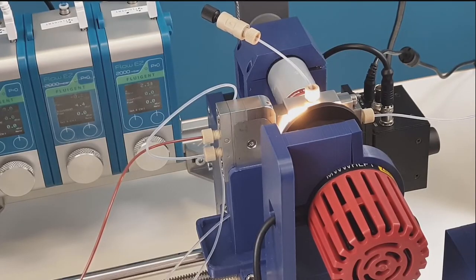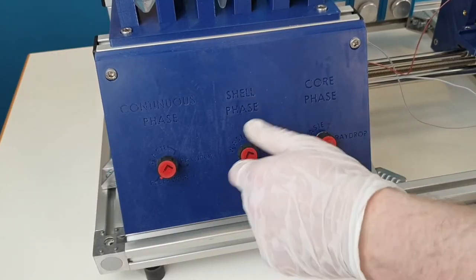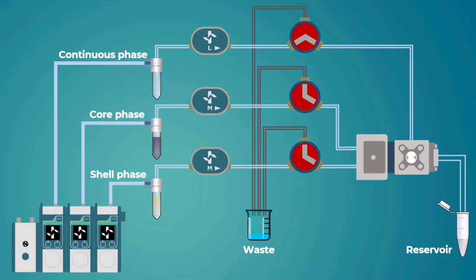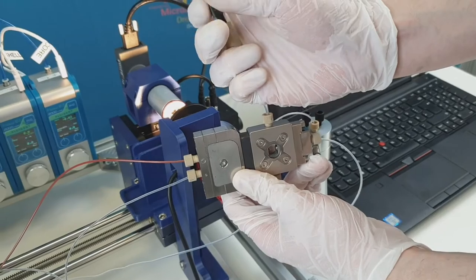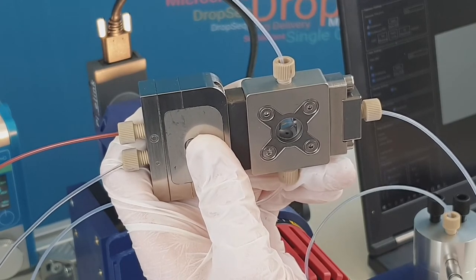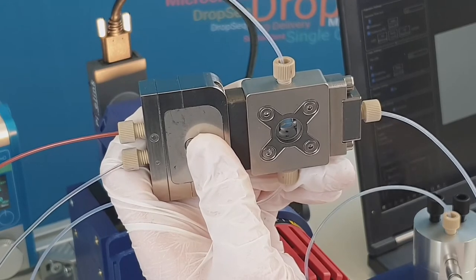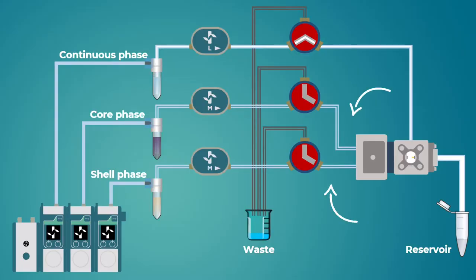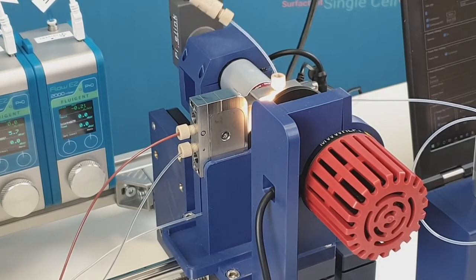Then all fluidic lines have to be sequentially filled with liquid. We use the manual valve to first close the core and shell phase and open the continuous line. The ray drop is held vertically so that the air contained in the tubing can rise to the upper port automatically. Open briefly the upper port of the ray drop to evacuate the air and close it again. There may still be air in the core and shell phase tubings. Maintain a stable continuous pressure to fill back with the continuous phase, first the shell channel and then the core channel, by opening the manual valves. All fluidic lines to the ray drop and to the waste are now wetted with the continuous phase and free of bubbles.